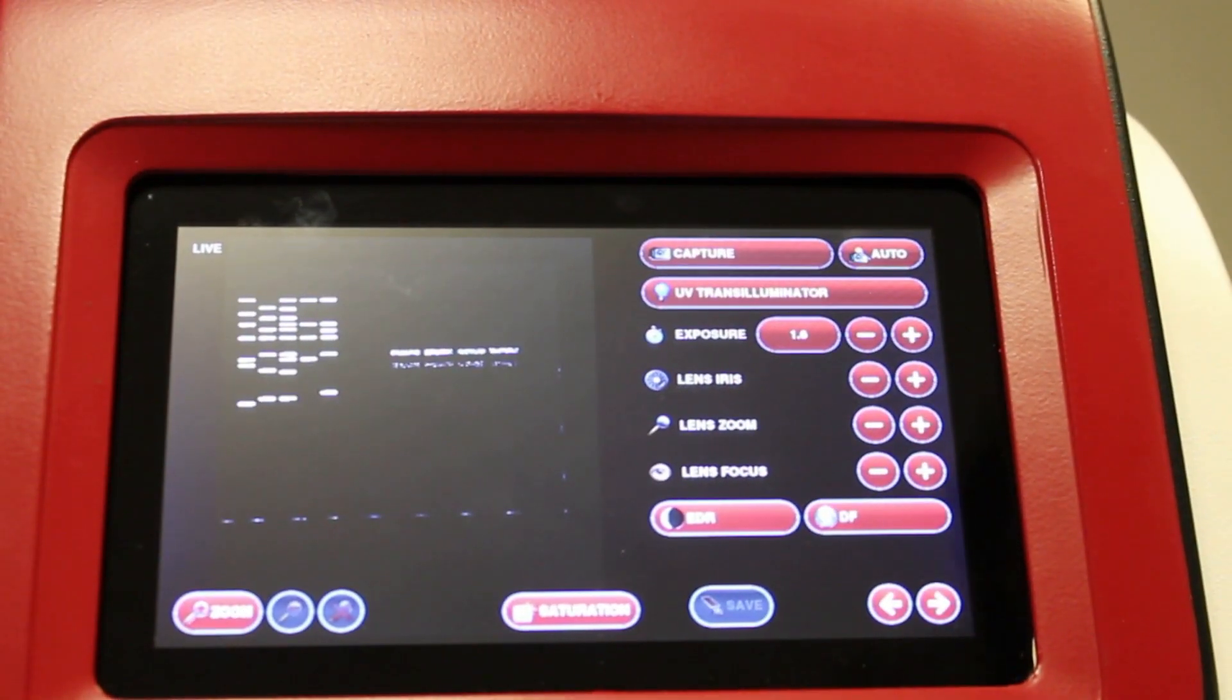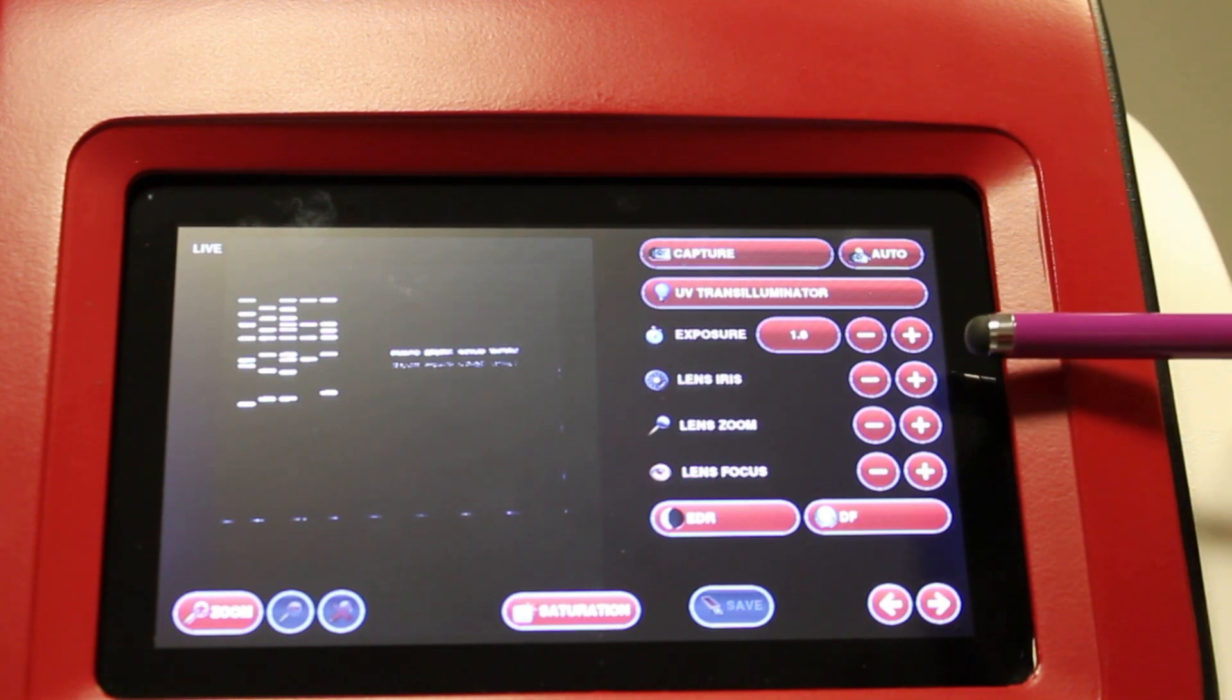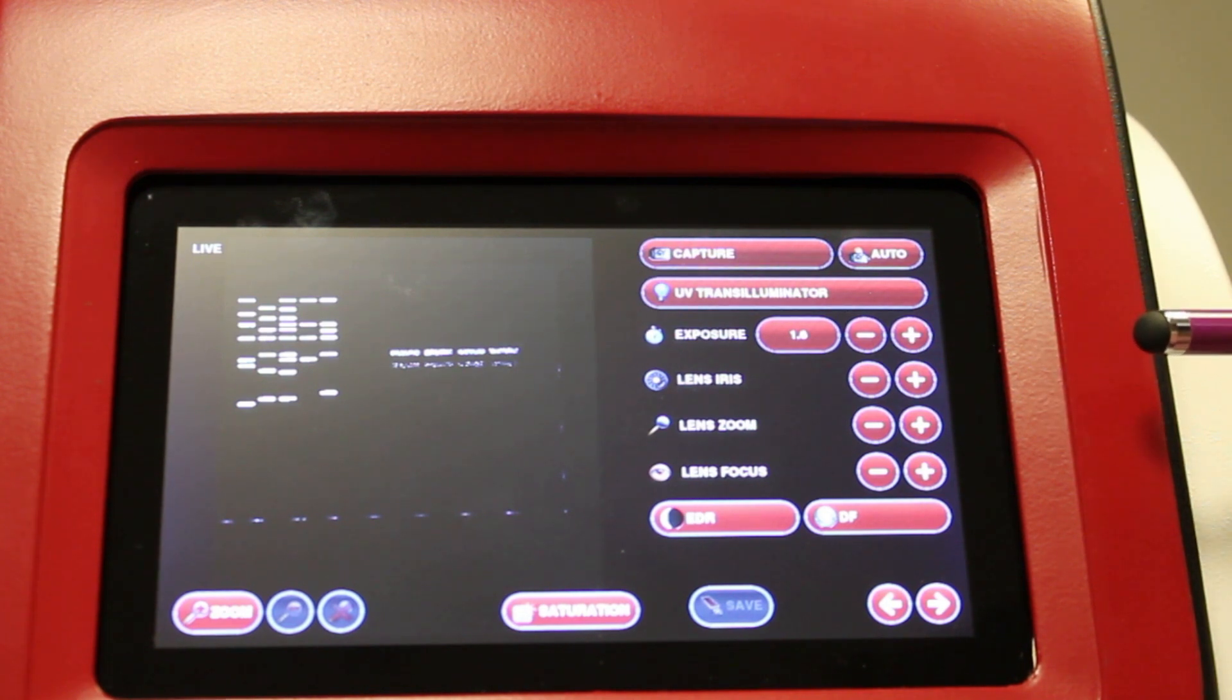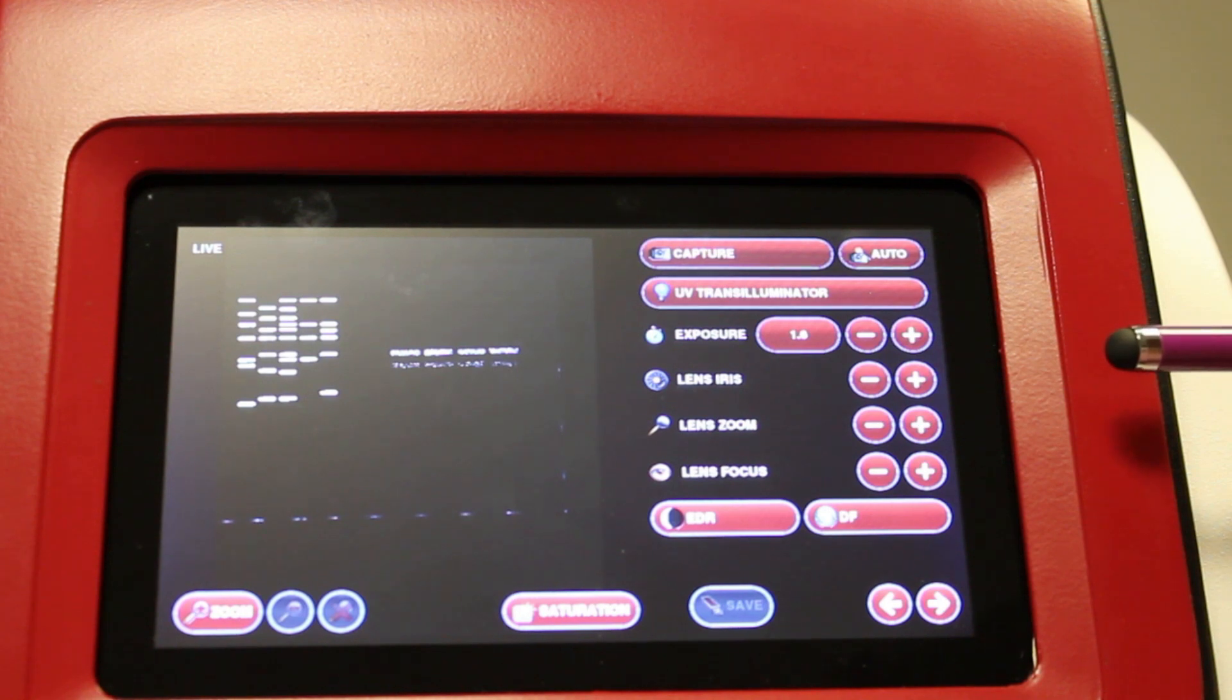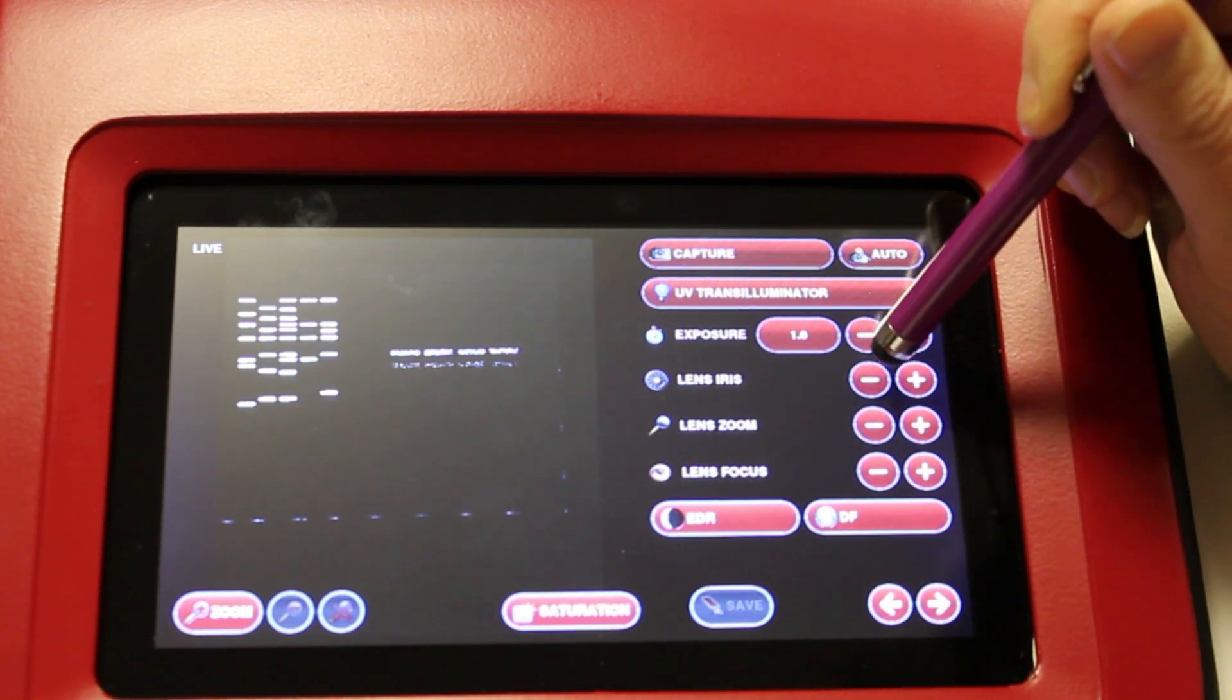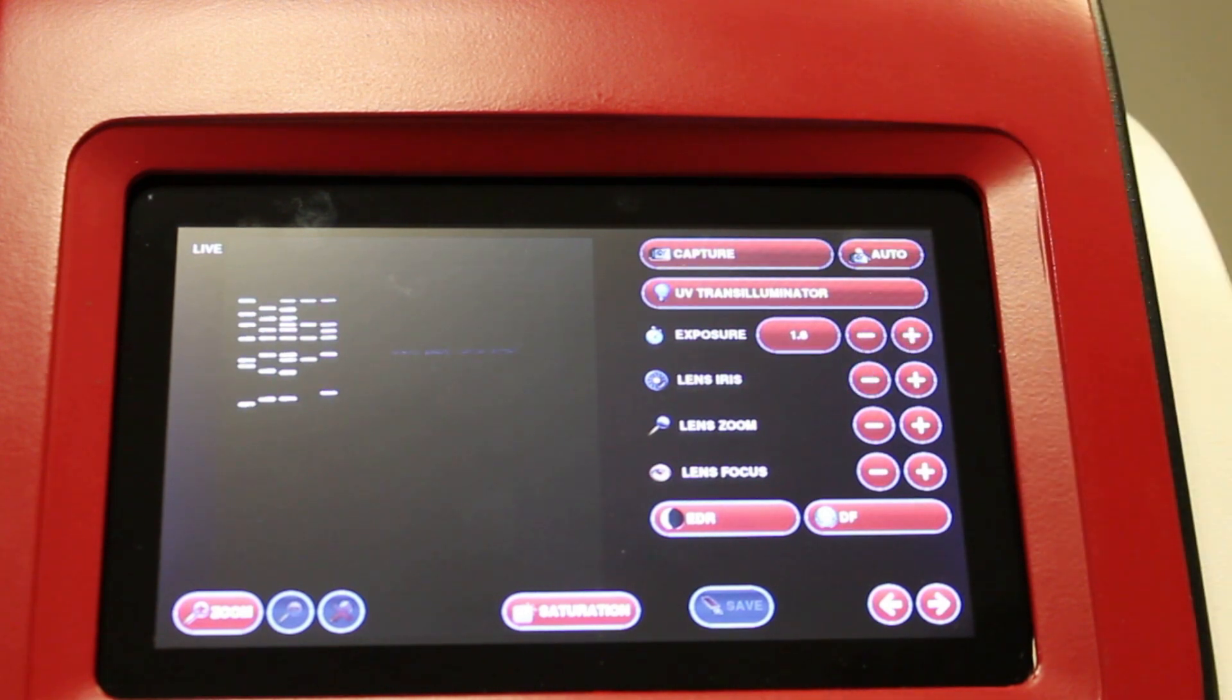The Neugenius system has a motorized lens which is controlled by the software. You have your lens controls here, including the lens iris. You can open the iris to let in more light. If you have a particularly bright sample, you can close the lens using the minus button here to reduce the amount of light hitting the camera.